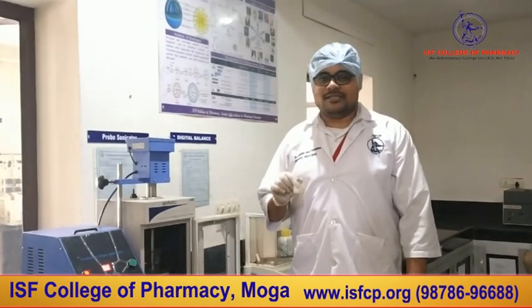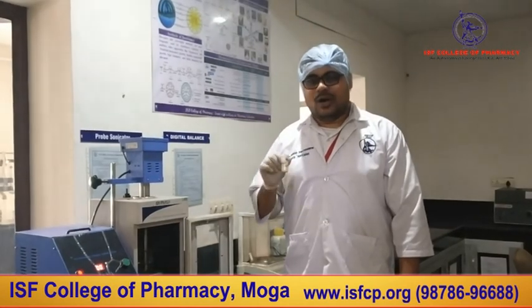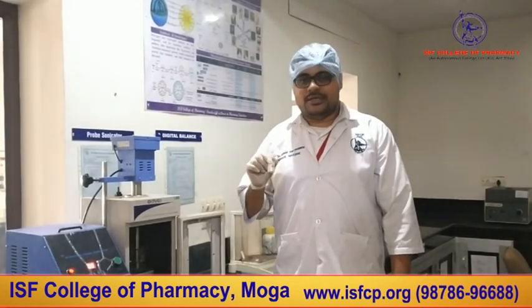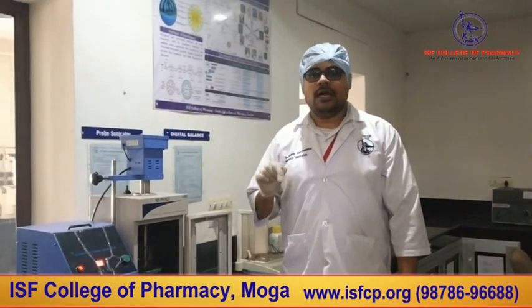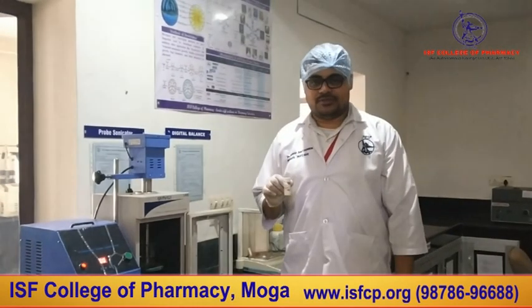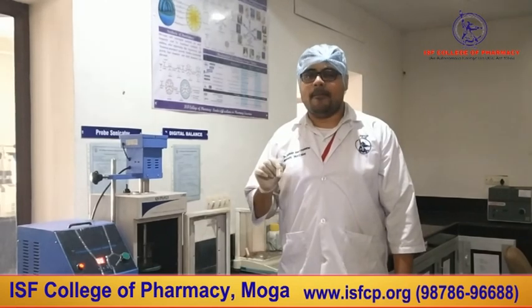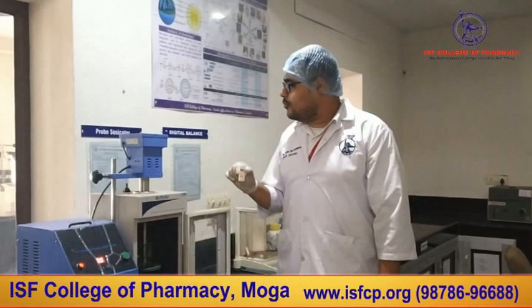What is the need for a probe sonicator? It will provide equal distribution of particle size and a more stable nano-emulsion. In our optimization process, we used 20 kHz frequency for 15 minutes while performing probe sonication.